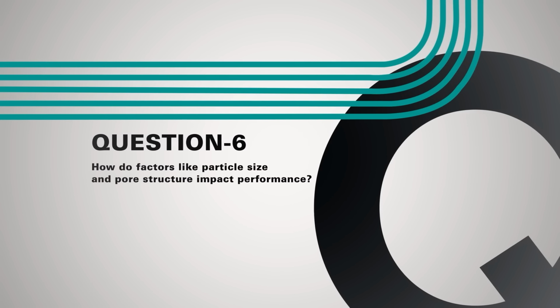Yeah. So obviously in chromatography, resin selection is a lot of things to consider. So how does particle size and pore size affect your selection criteria? Yes. One thing, when it comes to particles or chromatography, the first thing that I always want to talk to people about, before the particle size, is the pore size. Because you want to make sure that you select the right pore size for your purpose. The key of purification here is you want to make sure you can capture all the product of your interest, right?